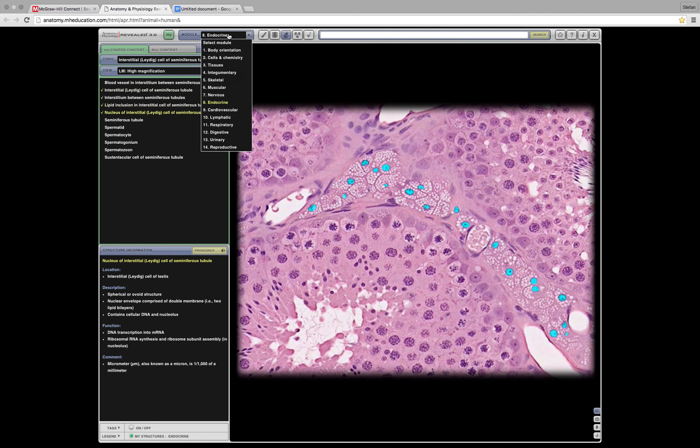High magnification. Much better. That is the big circle in the middle. Interstitial cells, which are basically the cells around the perimeter.